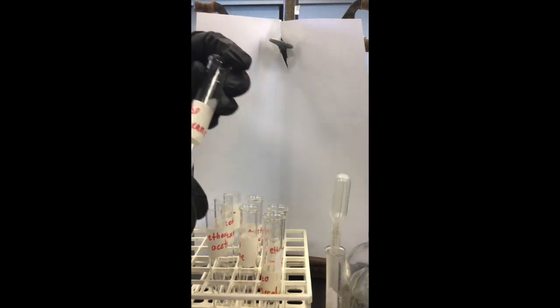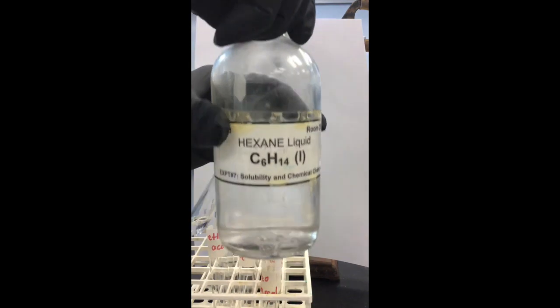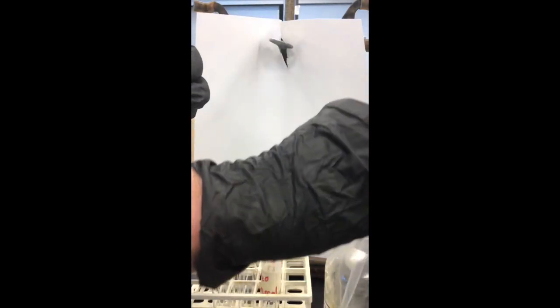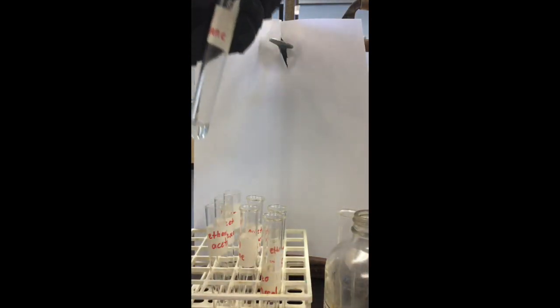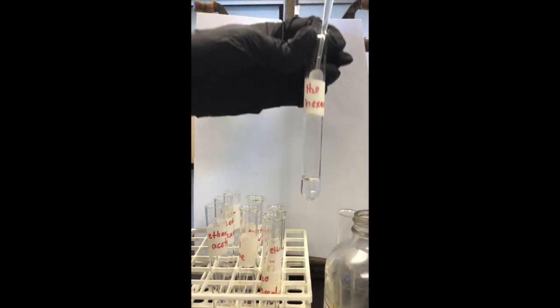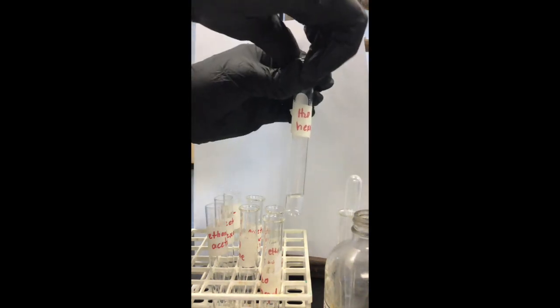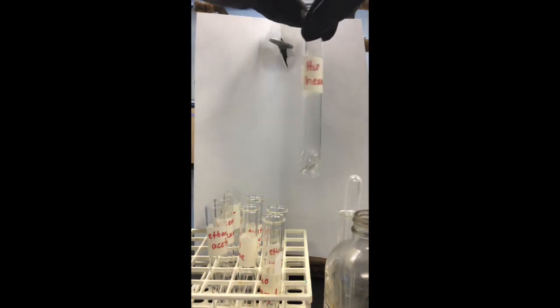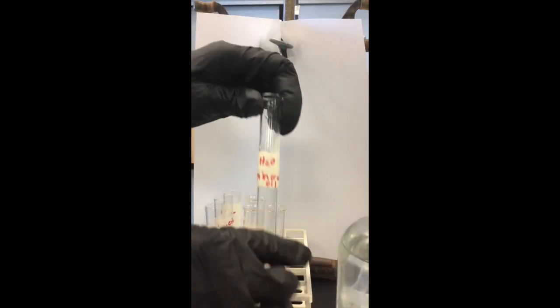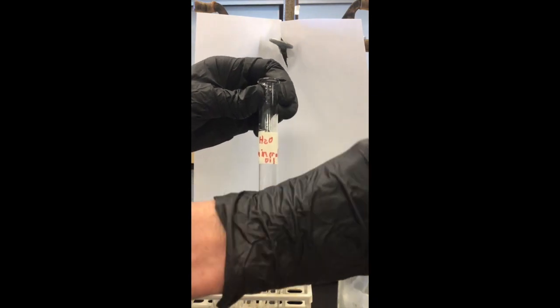The next one we have is water and hexane. Our next two solutions are water and mineral oil.